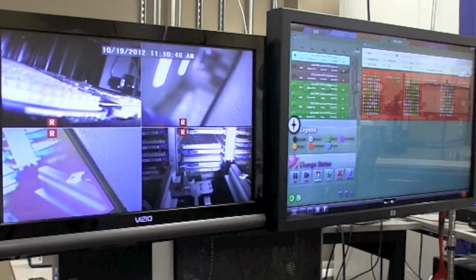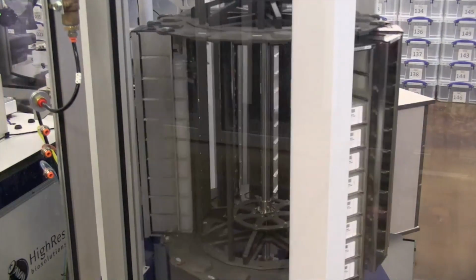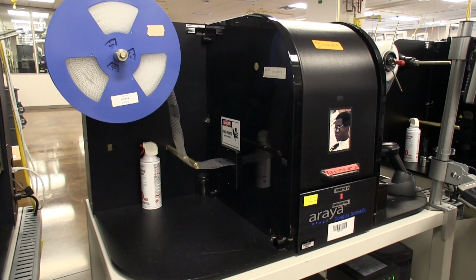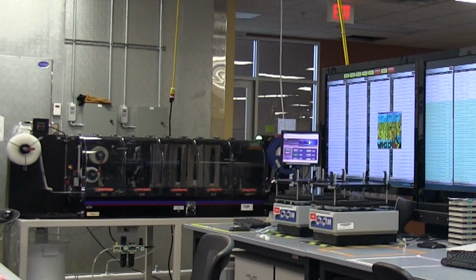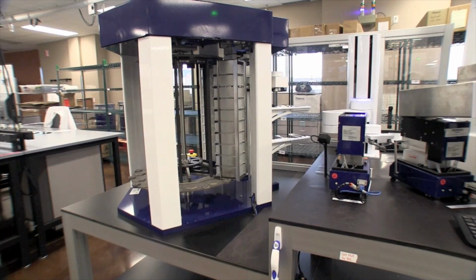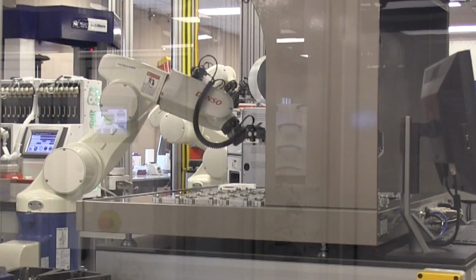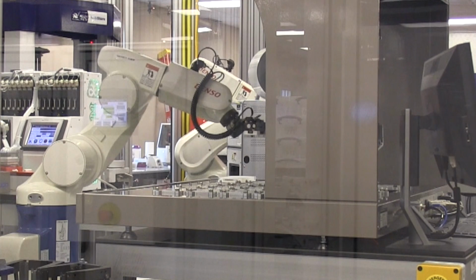The robots can perform 100 million tests per year, and it's so inexpensive that these genetic tests can now be used to improve crops in poor regions. The cycle of breeding and genetic testing can be repeated to add more and more genetic traits, leading to better crops and more food.